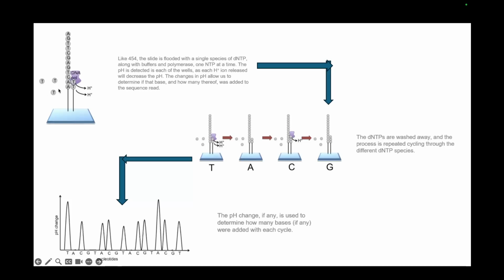So you'll have your own stretch of DNA. Now on top of this, the DNA polymerase will add the nucleotides one after the other, and after addition of each nucleotide, there will be a change in pH, which will be signatory of the base that has been added. And after this, this is what the output will be. So for each change in pH, you can attribute that to a particular base that has been added, right?